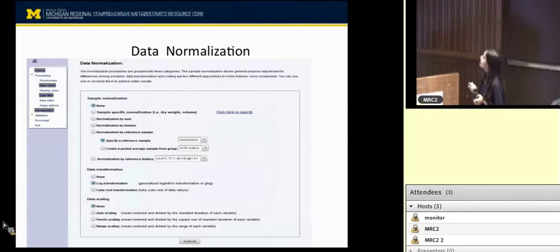And then these are different normalization methods that are there in Metabolomics. For normalization with respect to internal standard, we just have the option right now for the reference feature as one feature. So if you have good internal standards, before this you can take the median of the internal standards to correct for it, or you can pick your best reference feature here and use that for normalization.